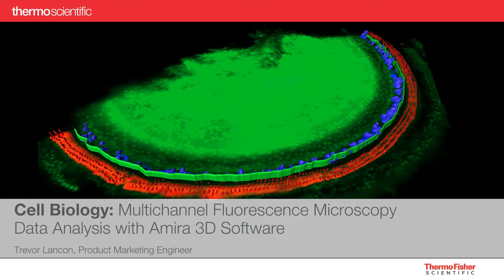This will show you how Amira's visualization and analysis tools can extract information from separate 3D channels and combine the results into one coherent analysis. Amira for Cell Biology helps researchers perform many other tasks and analyses. Check our web pages on amira.com for more information.